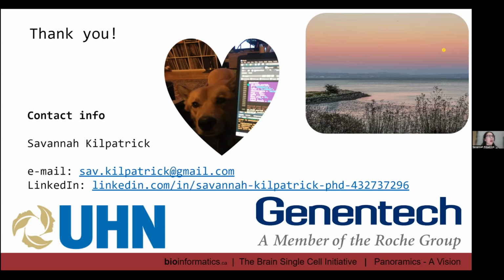The last thing I'll say about that is you can also perform pseudobulk in your spatial transcriptomics, and that can provide a bit more power. If you think of the argument of going from 2 micron to 8 micron to 16 micron bins, you're increasing your signal each time, right? What we've done in the past is, as I mentioned, we work with the dorsal and the ventral organoids that are fused. We've done just pseudobulk analysis, so just isolating the dorsal side of each of our conditions and comparing that. And that's perfectly valid as well. It just all depends on your biological question.